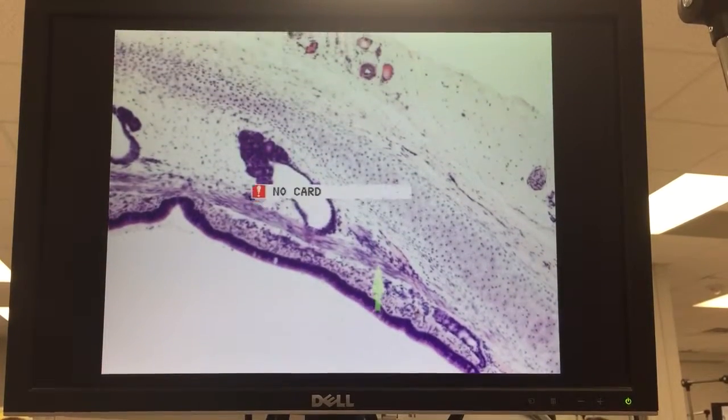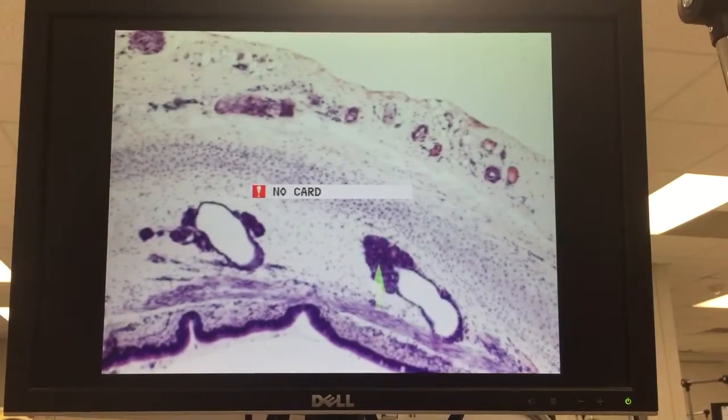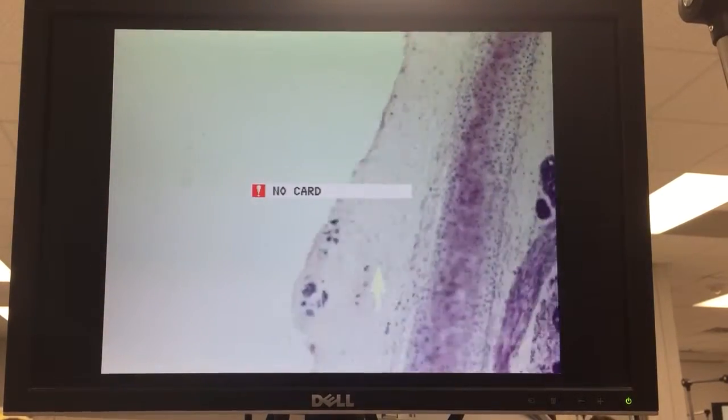That's still trachealis muscle there. In the end we have some submucosal glands, and then attaching tissue on the outside.